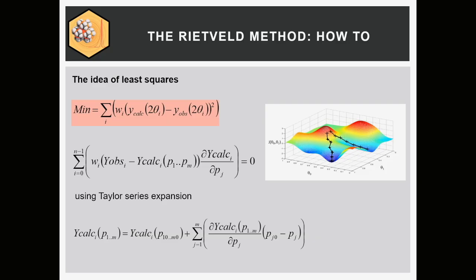If you just have 2 parameters, you could imagine that this is the surface of the Earth, right? The surface of the Earth is 2-dimensional. Now basically you start at some nice peak in the Himalaya, let's say 6,000 or 7,000 meters high. This is where your parameters start, because you have to have starting parameters. So Rietveld is not a global optimization method. You have to be reasonably close to the correct numbers. Global optimization, we talk about later, is a different story.